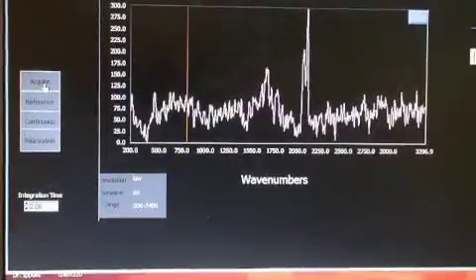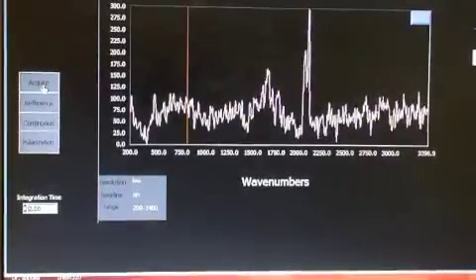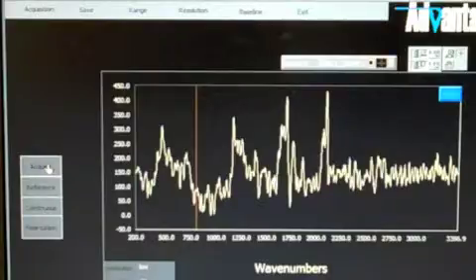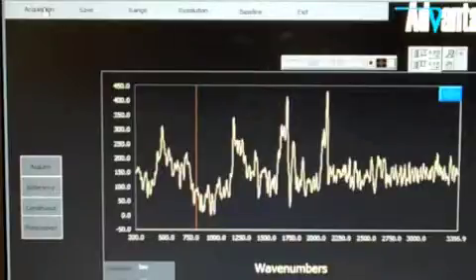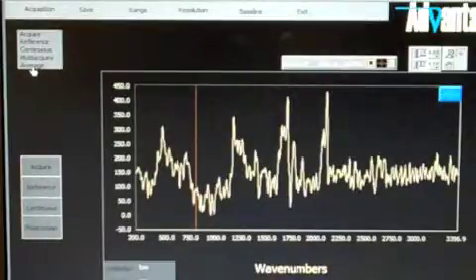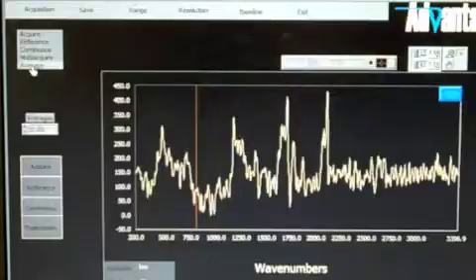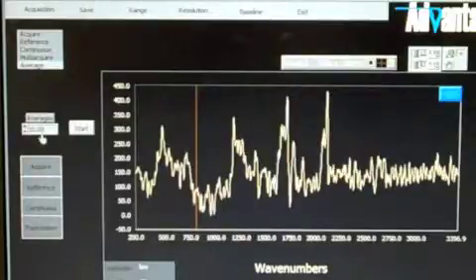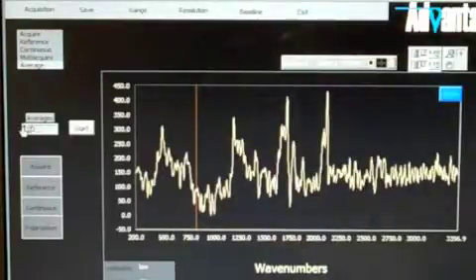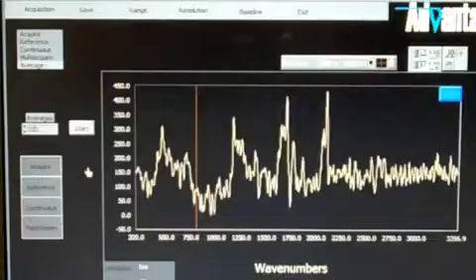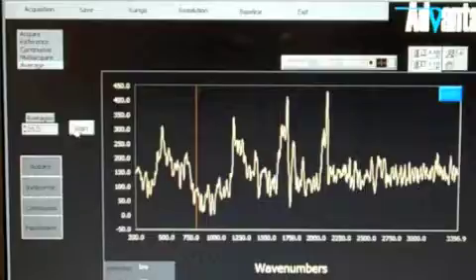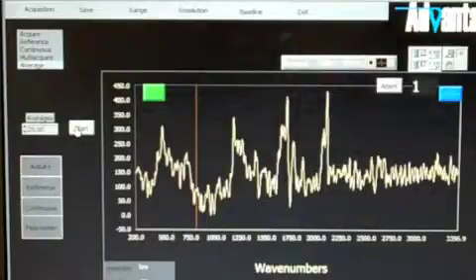Since Raman scattering can be a weak signal, noise may be a problem. There are two ways to improve our signal to noise ratio. The first approach is to average several spectra. You can do this by selecting the term average from the acquisition menu at the top left-hand side of the screen. A box will open to allow you to type in the value for the number of scans you wish to average.